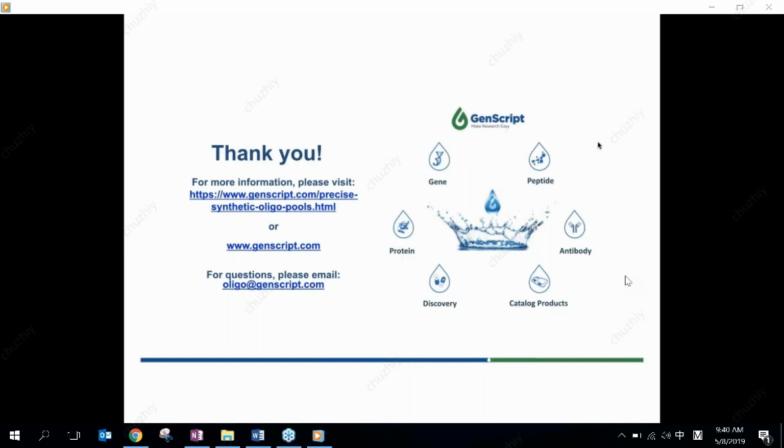Okay. And can you explain again how you tie the barcoded DNA with the peptide sequence during oligo insertion? Could you repeat that one, please? Can you explain again how you tied the barcoded DNA with the peptide sequence during your oligo insertion? Yes, definitely. Can I share my screen again, or maybe not? I guess just briefly explain it.